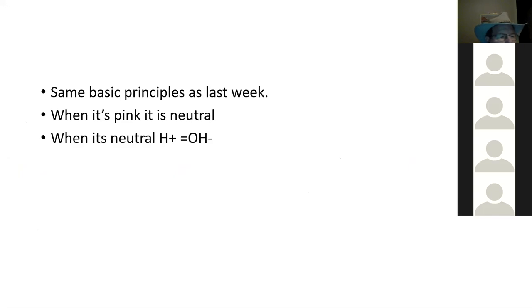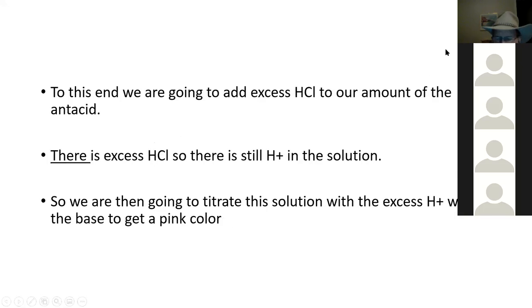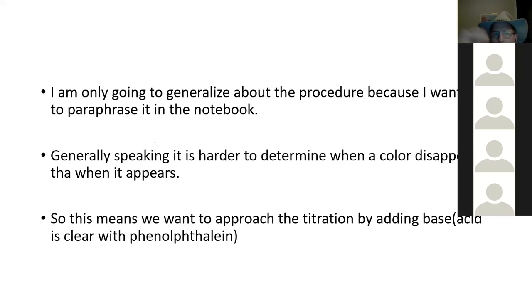Guys, we're using the same principles we used last week. When it's pink, it's neutral. When it's neutral, H plus moles equal OH minus moles. Same basic technique as last week. I'm only going to generalize about the procedure because I want you to paraphrase it in the notebook.